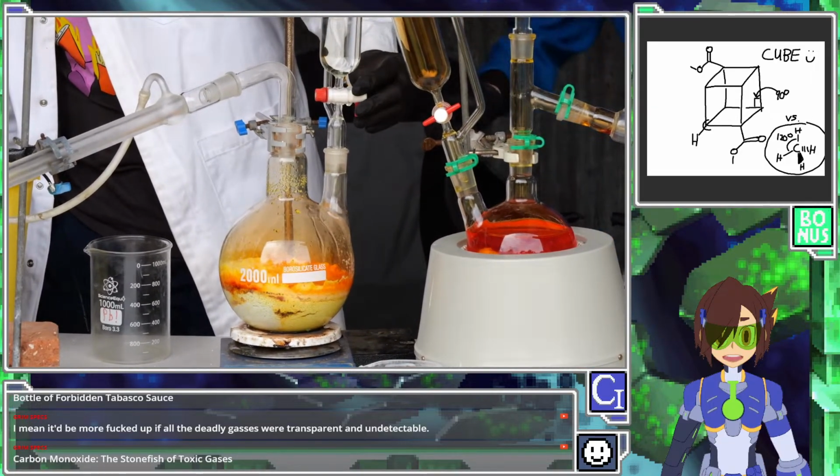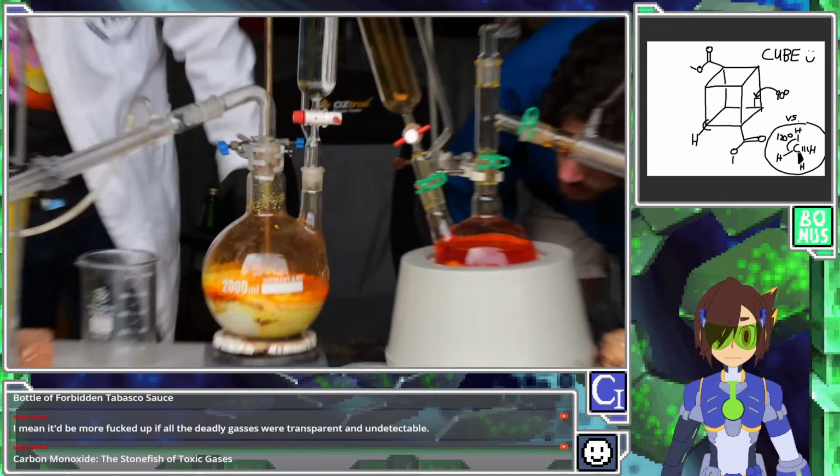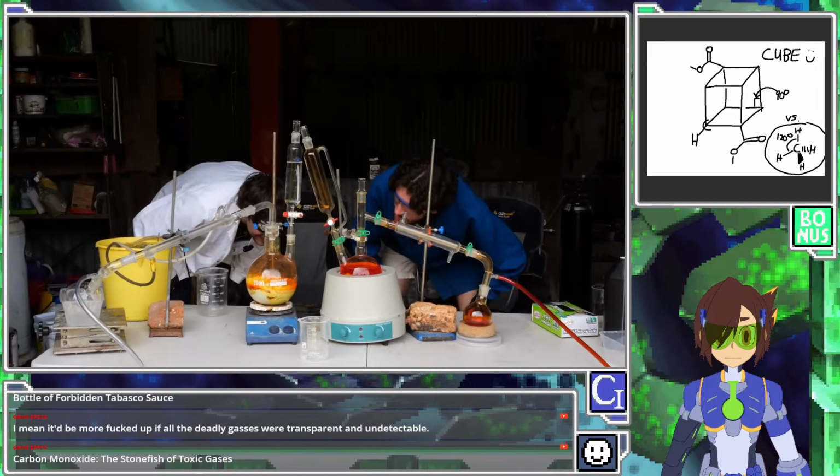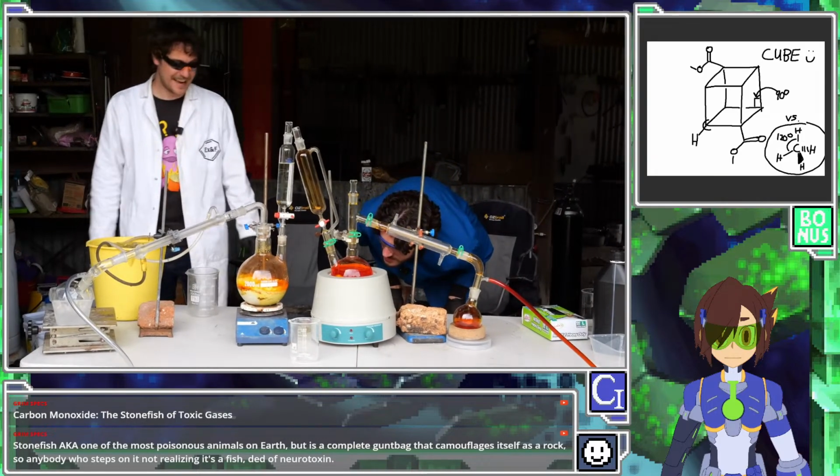Oh yeah, because it's got the sodium bromide. It's kind of caking up on the top there. I'm worried it's just going to go... Yeah, you're right. I didn't expect it to cake so hard.